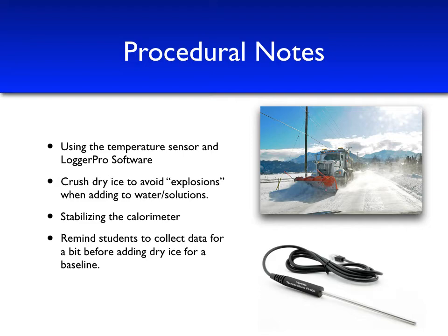This will allow us to look at the temperature as we add dry ice to our solvent or solution in part 1, and add salt to our ice in part 2. We'll be able to see where the temperature remains constant, one of the criteria for determining if our sample is at the freezing point.